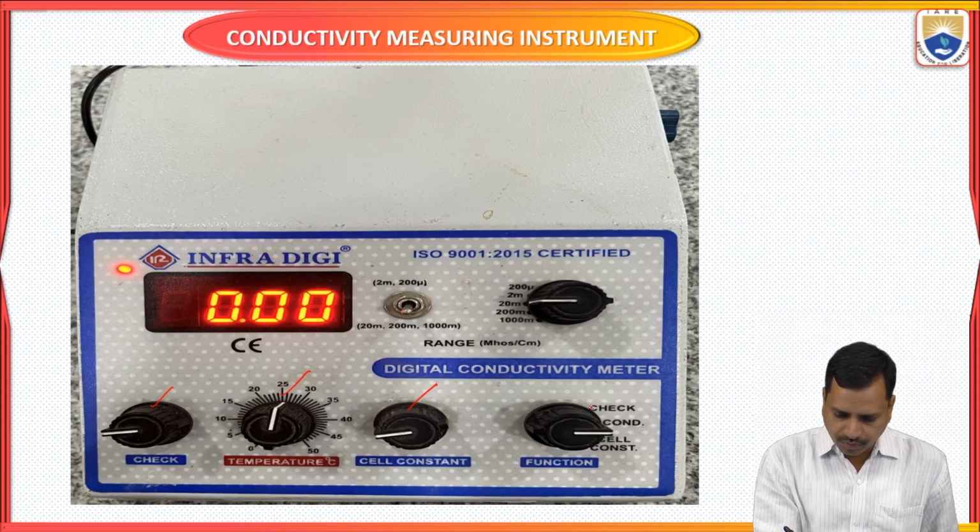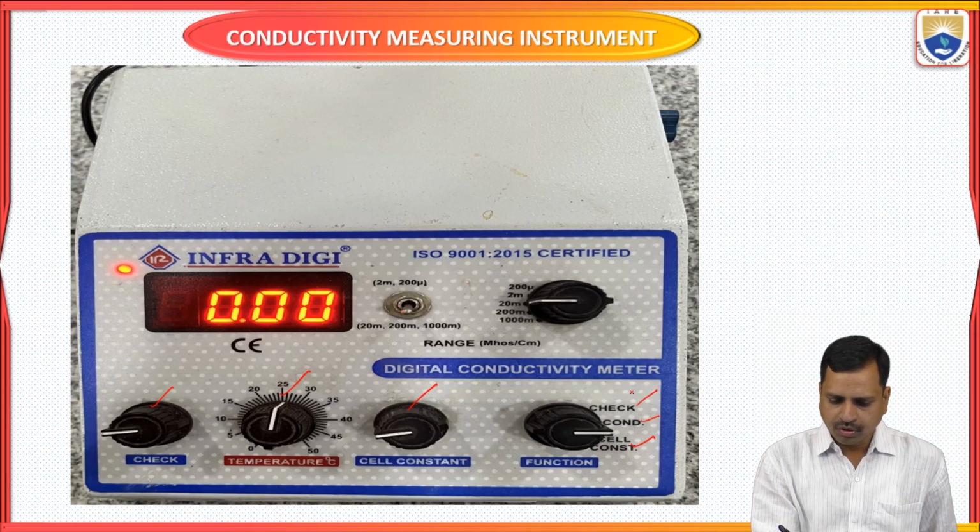This has 3 modes: cell constant mode, conductivity mode, and check mode. When we are checking, we keep this mode. When we are measuring the conductivity, we use this one. And when we are adjusting the cell constant, we put it in this mode.